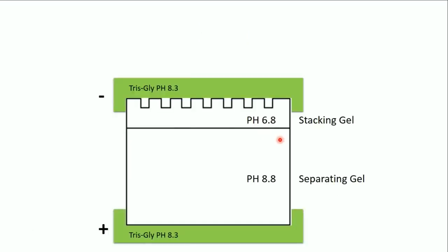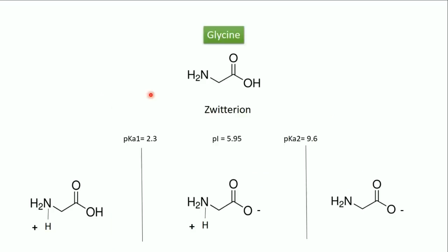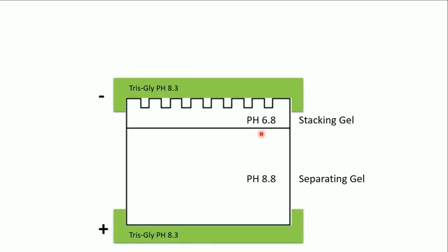So let's see. When the pH in the electrode buffer is 8.3, glycine is negatively charged. As you see here, glycine at 8.3 is negatively charged. So the glycine will migrate from the negative towards the positive pole because it's negatively charged. But when it enters the stacking gel, in which the pH is 6.8, the negativity of the glycine decreases, and then the mobility of the glycine becomes so slow. So I will speak about each one of these separately.